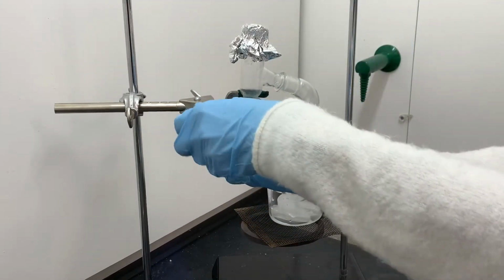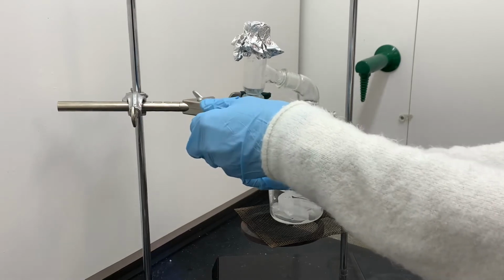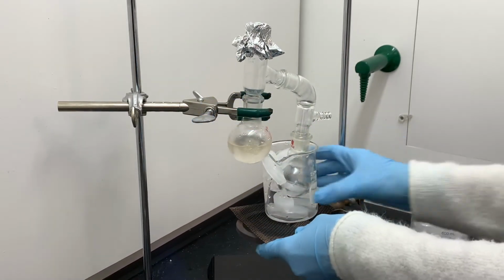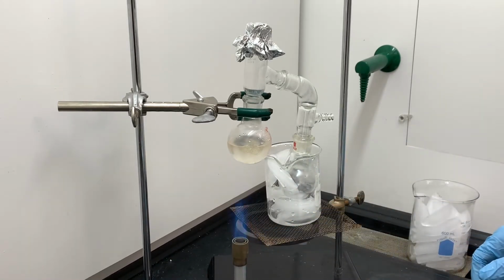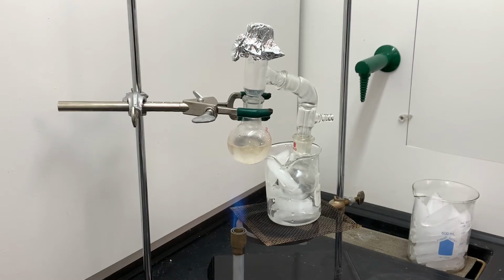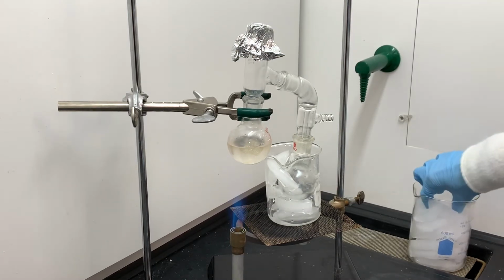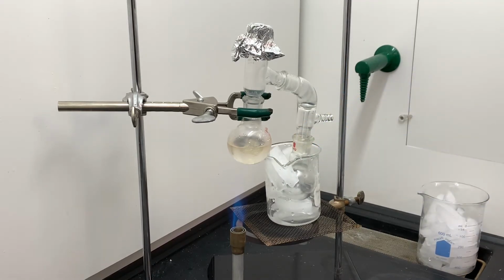Now this glassware is difficult to get positioned just right, and that's mostly because I can't use Keck clips. So the glassware kind of twists itself around. But once I get it into a spot that I like, I'm just basically gonna not touch it. So we're gonna let this sit and react for a while. There isn't a specific time here. We're just trying to get a good amount of product collected in that receiving flask.